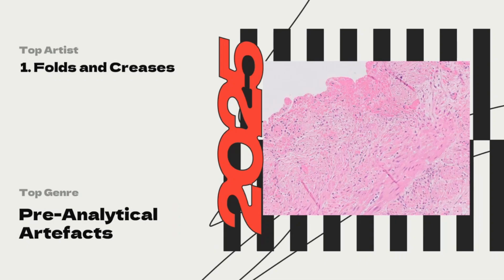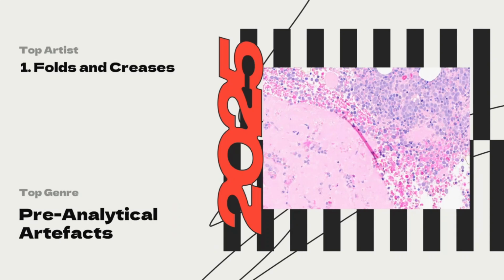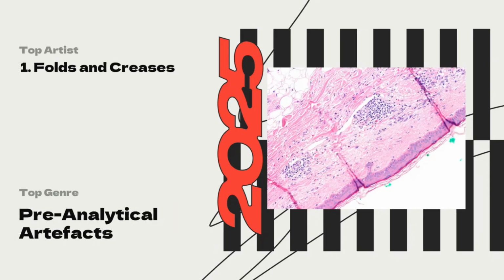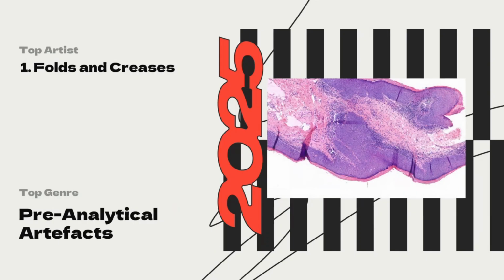This is just an example of some folds and creases, but you can see yourself they're in focus, they're beautiful. This person didn't lose any marks for this. And the same for this one. Again, it's a lovely fold. It's been imaged beautifully. However, when we start having folds and creases where it starts knocking it out of focus, then we do start removing marks for this. And this is just a worst case scenario where I've got a lot of folds and creases, a lot of areas that are out of focus.